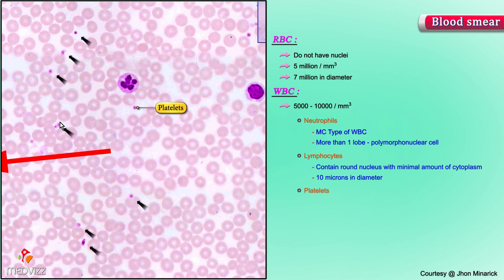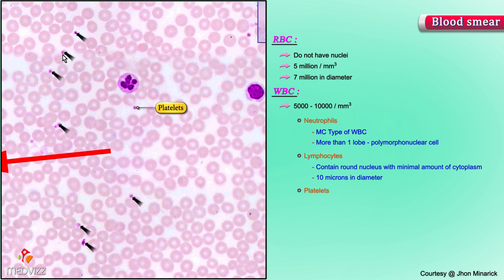All of these little dots, which look like little flecks of material, are platelets. Sometimes they are between the red cells; sometimes they overlie partly or fully the red cells. There are about 150 to 400,000 platelets in the average cubic millimeter of blood.